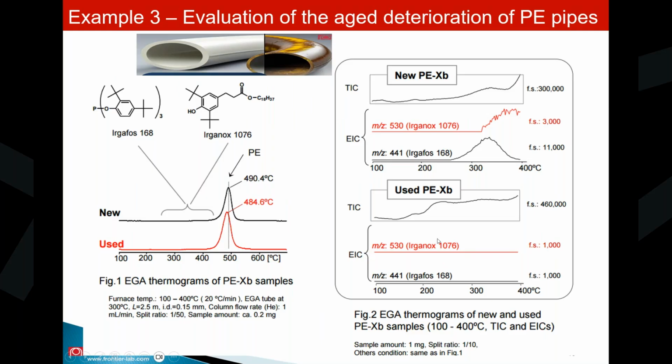So due to which the material degradation is starting. The antioxidant is really helping to keep the thermal stability of the material at the beginning. As we use it over a period of time, these antioxidants disappear due to degradation, due to which the base material also started decoloring, and also getting reduced in terms of the molecular weight of the material.